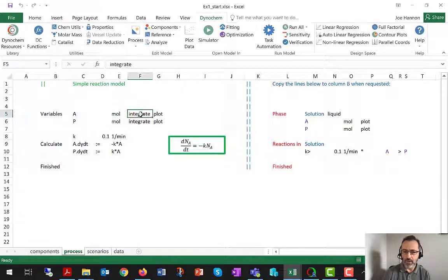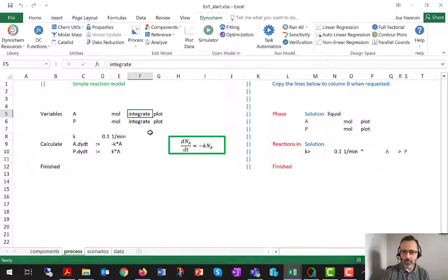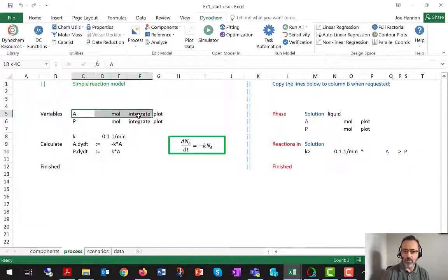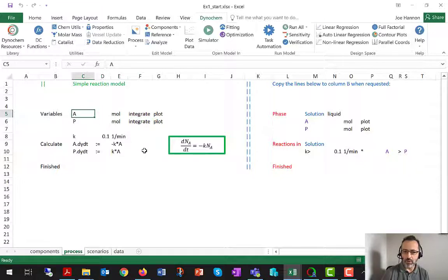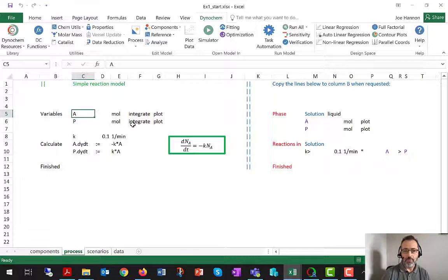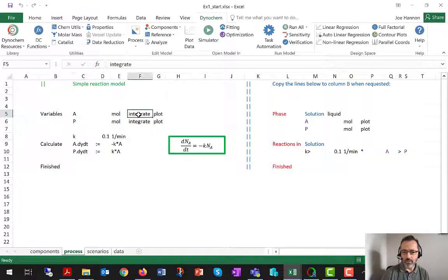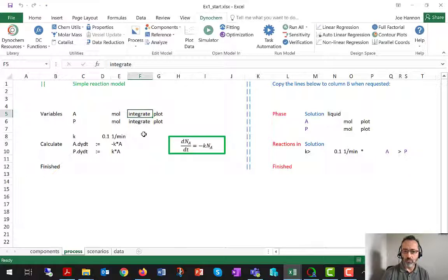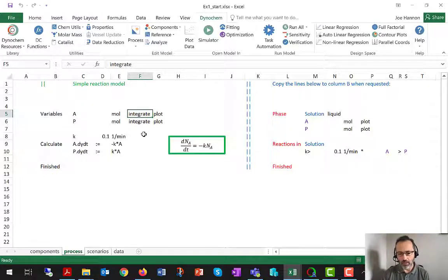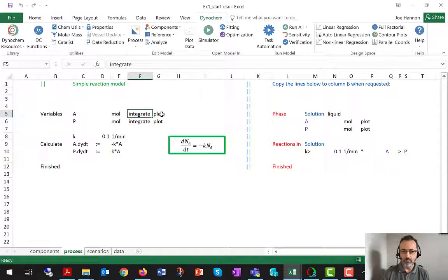Crucially, the attribute integrate written beside A, so that the software will be expecting to read about A.dydt or DADT and solve for that. So integrate is a keyword I think you haven't seen before. Very important if you're going to make your model entirely from user-defined variables.